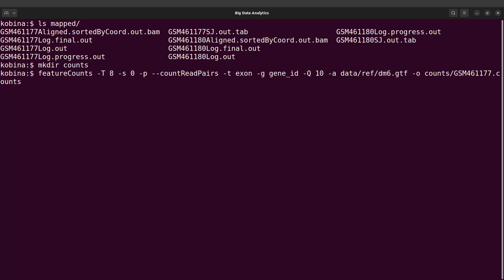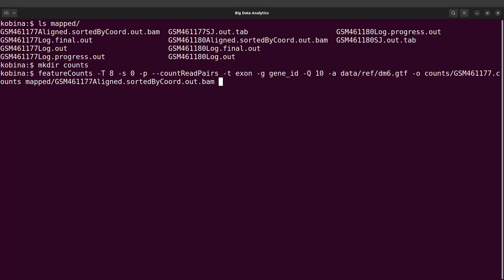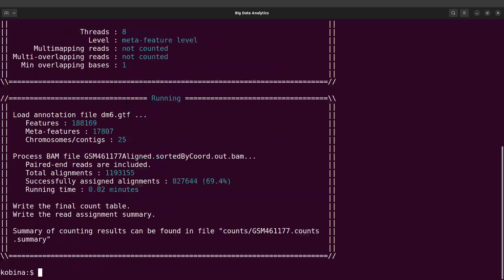Now we also need to specify the BAM file. The BAM file we need to specify should be here. So we specify mapped/ and the BAM file. Now we will run featureCounts.